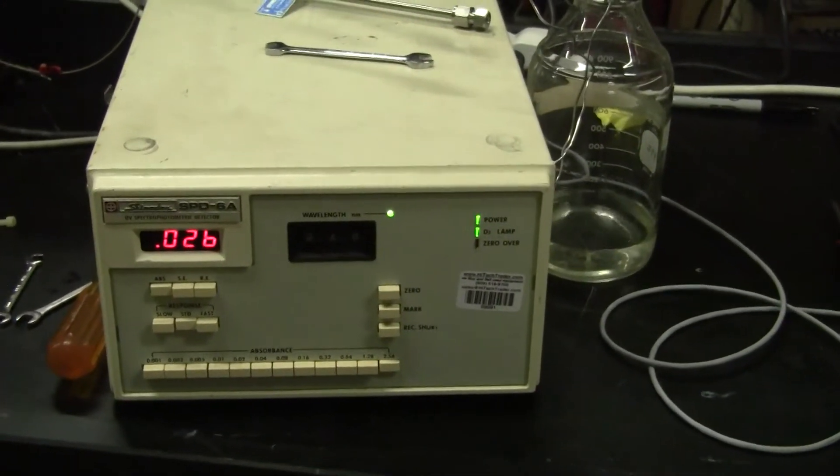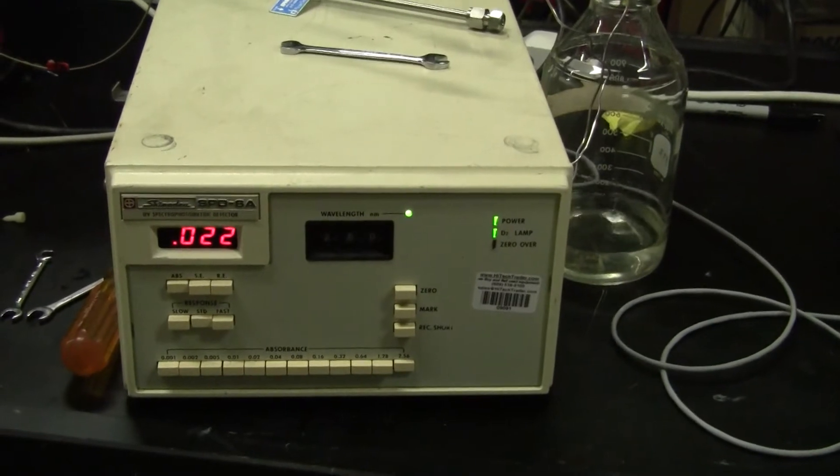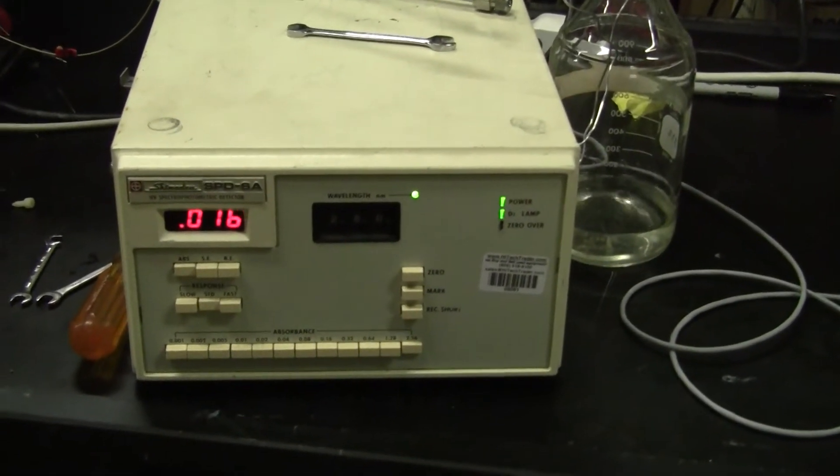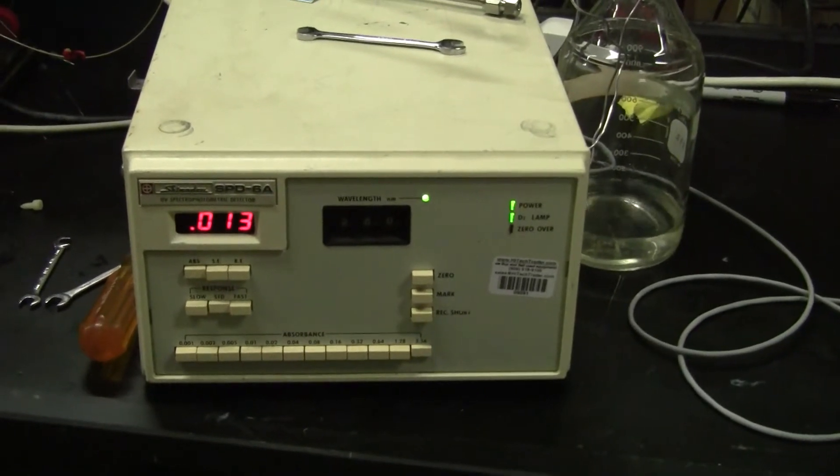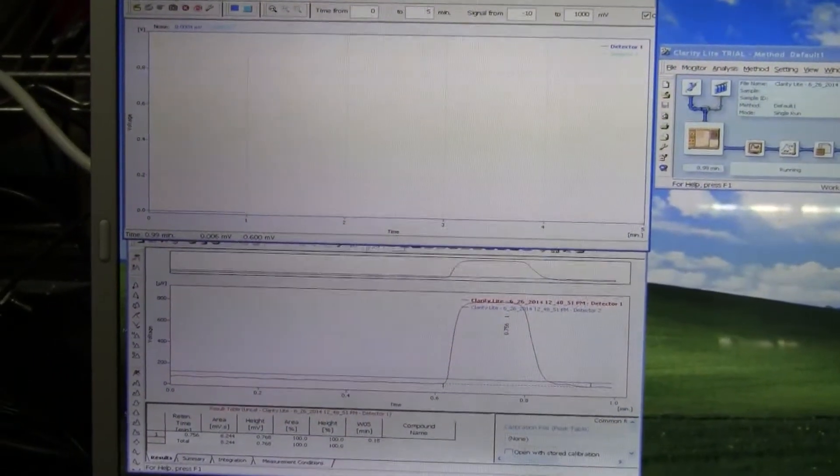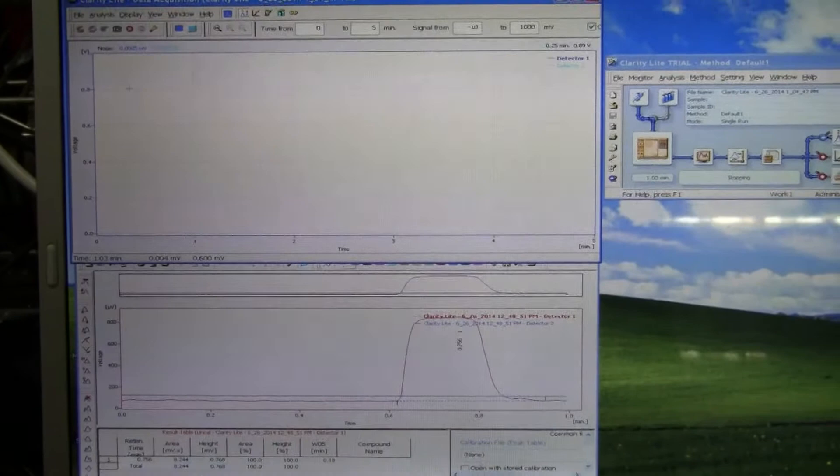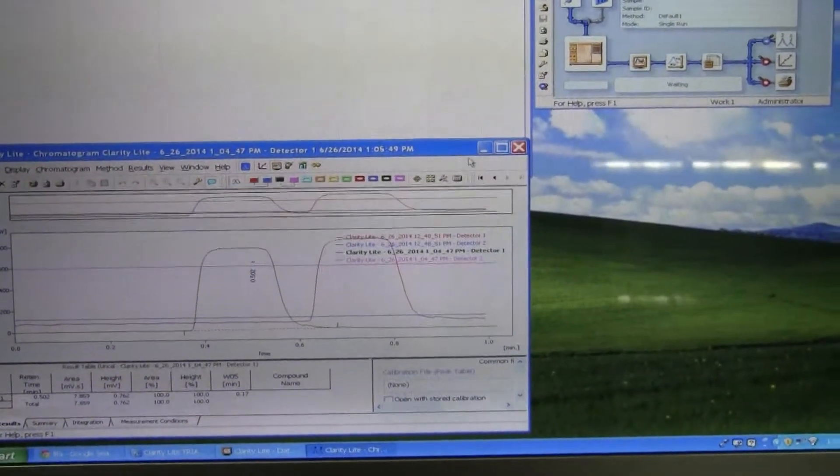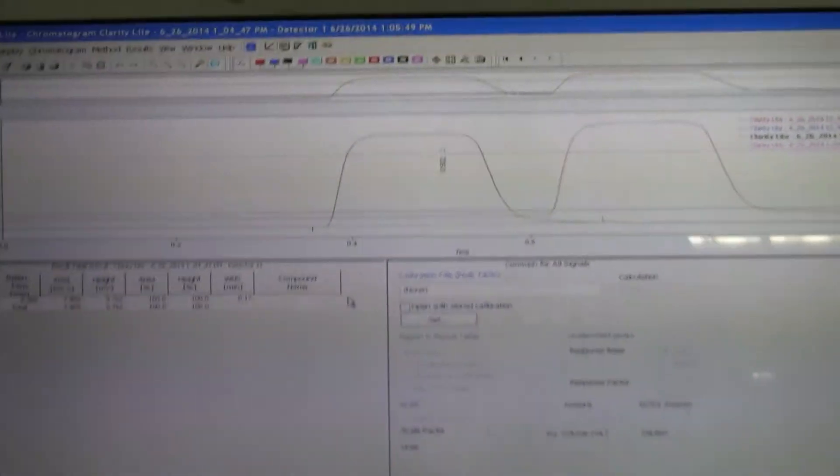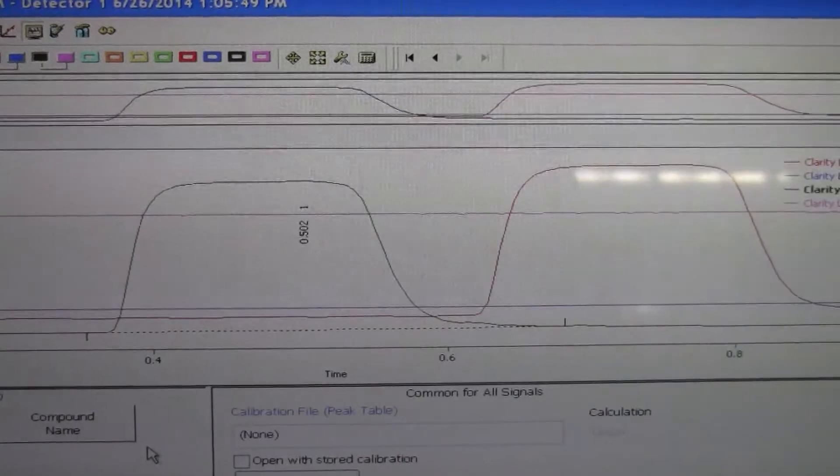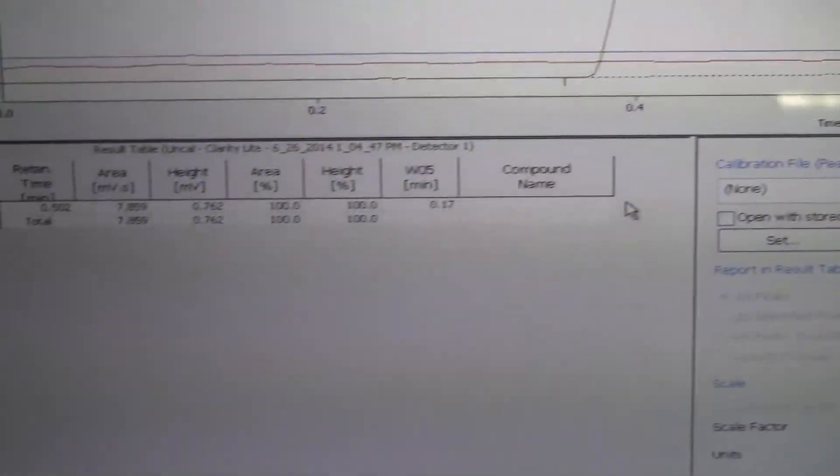Let that finish up. Now, let's just stop. And then we can find our calculations. There's our peak, there's the sample I ran before, and now the current peak, and there's our data.